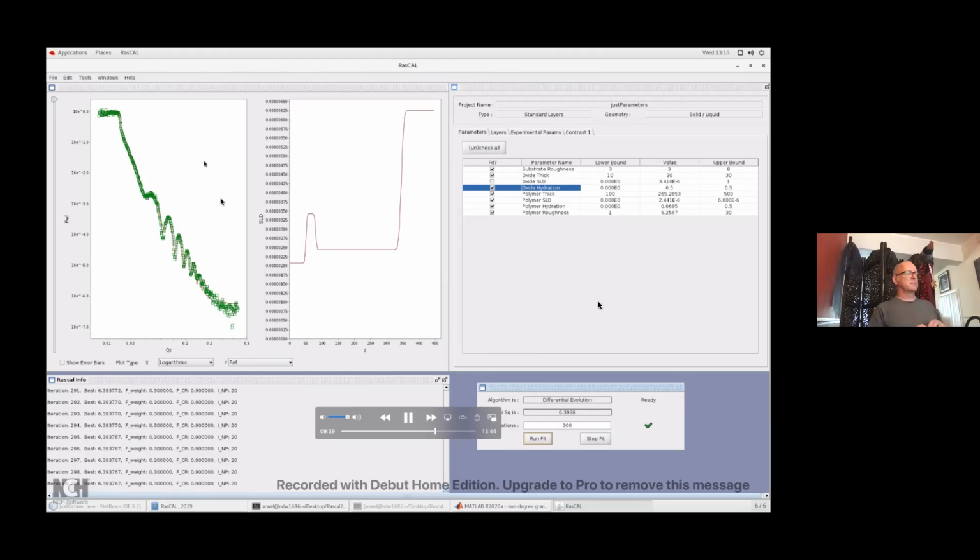So this just showed the flaw of the constant resolution, basically, because it's overestimating resolution here, underestimating resolution over there. But like I said, this is normally built for RasCal type, MATLAB type data. So in this one, you don't have this fourth column variable resolution, but it will be in the RAT toolbox. And that's basically it.